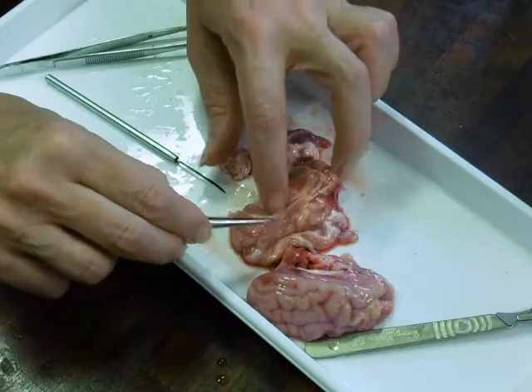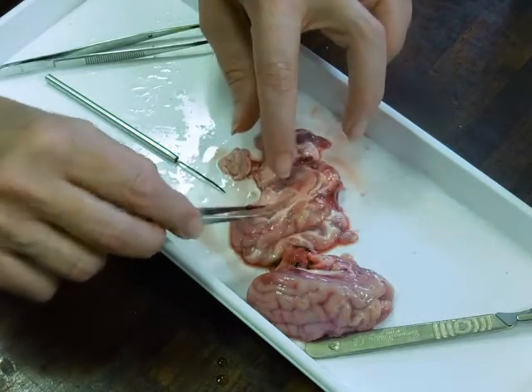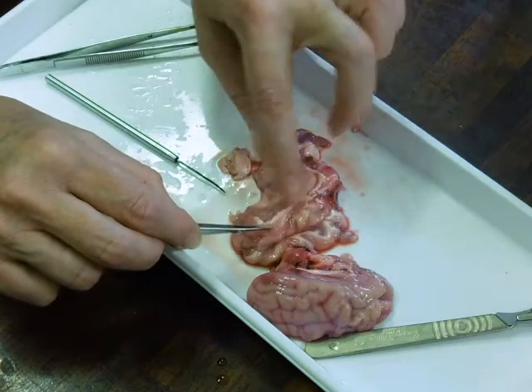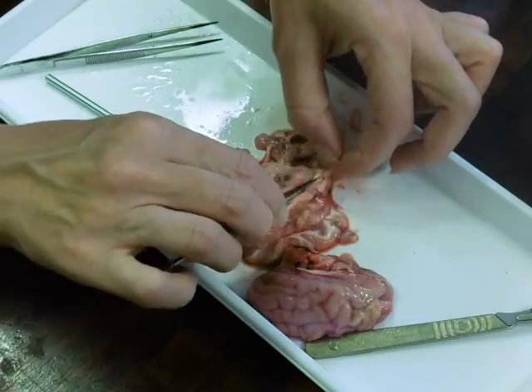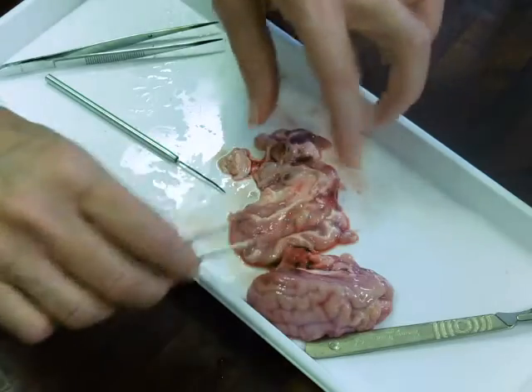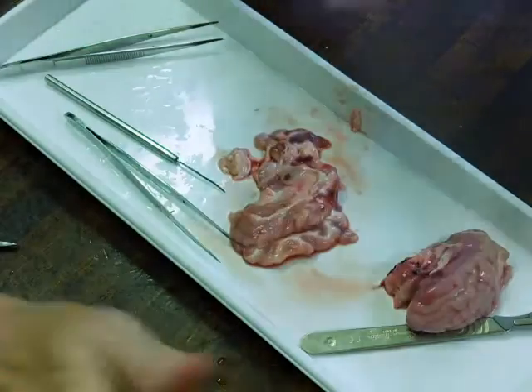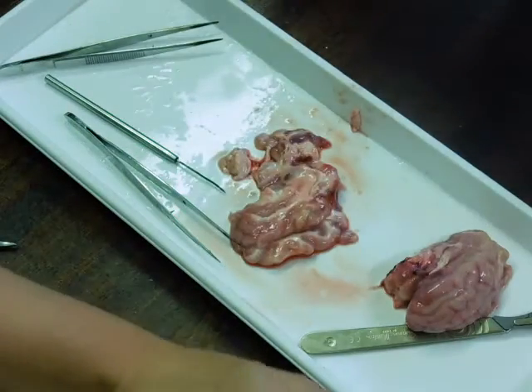There's fluid-filled spaces inside your brains called the ventricles, that have got the spinal fluid in. So I'm thinking that's what that is in there. So if you want to have a go at it anyway, if you want to have a look at it, leave that half for the other group and you can come and have a look at it and have a touch of it and feel what it's like. I'll just go and wash my hands.